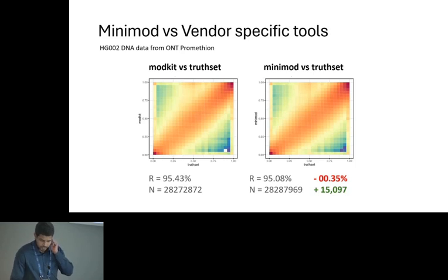So about the accuracy, we compared it with ModKit and pb-CpG-tools. The accuracy compared to the gold standard bisulfite methylation frequency results we have was similar to ModKit's output and pb-CpG-tools output, while reporting many other data points compared to the vendor-specific tools.